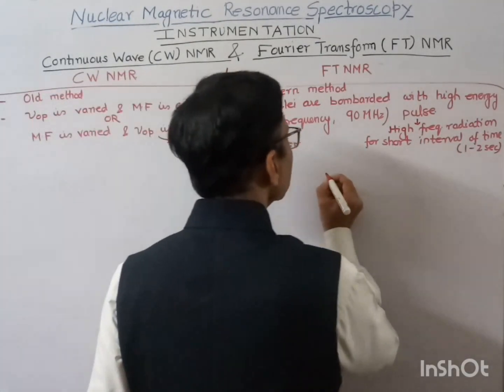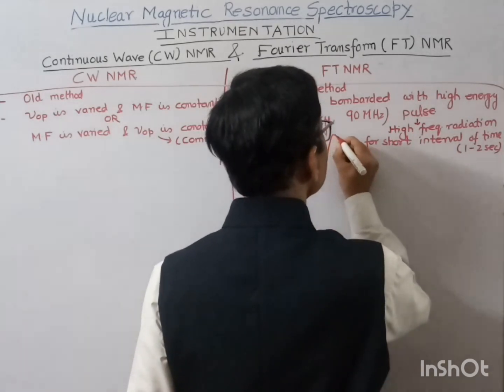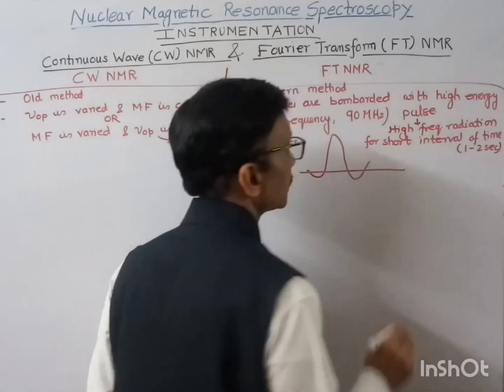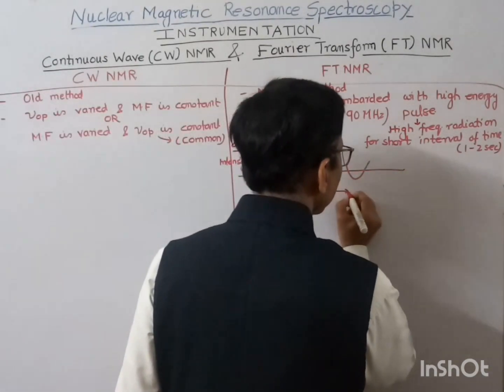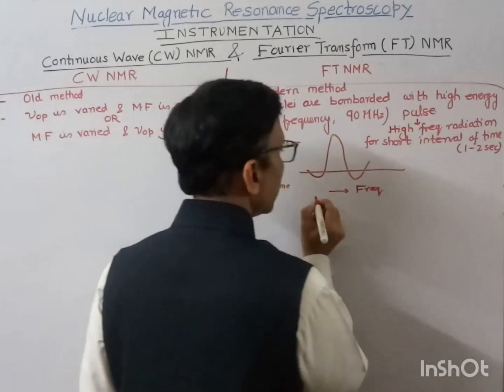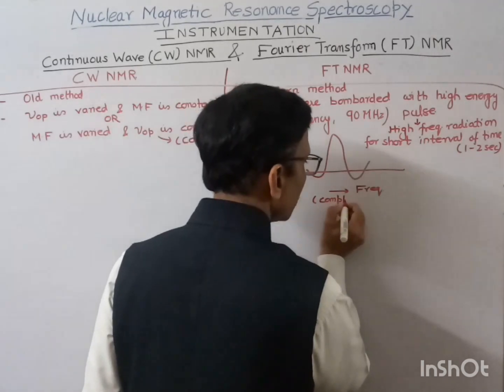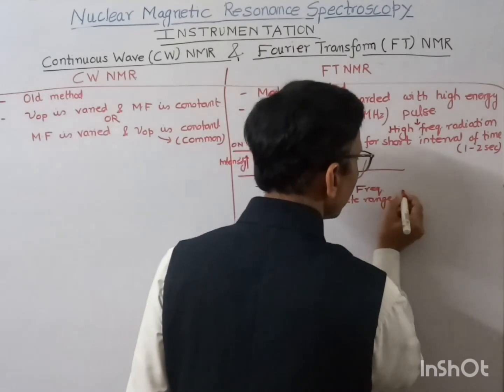We may also represent the pulse in this way. Here it shows the complete range of frequency.